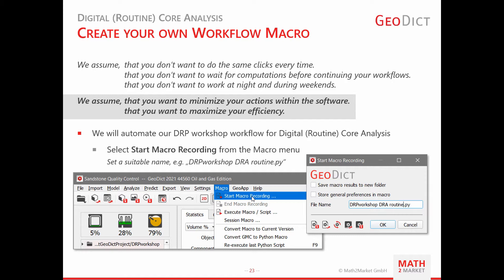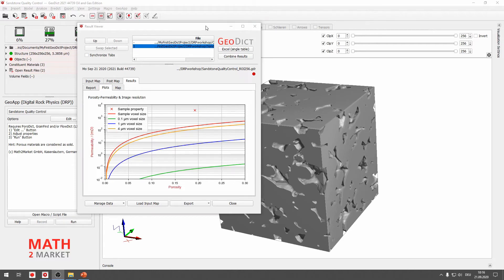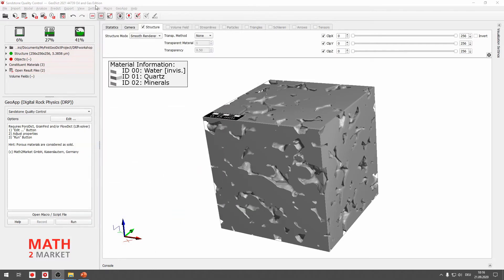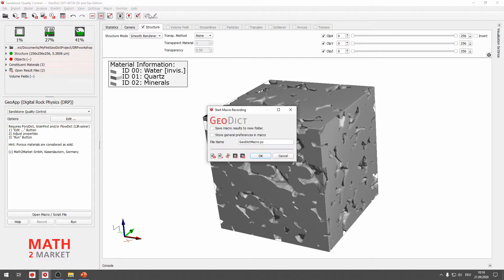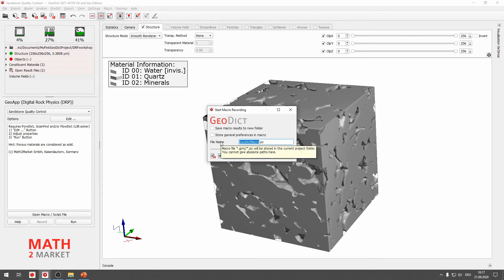Back to GeoDict — first, minimize the result viewer, then go to the GeoDict menu bar and select the Macro menu. In the Macro menu, select Start Macro Recording. You can then select the file name for our GeoDict macro. We will call it DRP_Workshop_DRA, meaning digital rock analysis routine. Click OK. From this point, every action performed in GeoDict will be recorded.